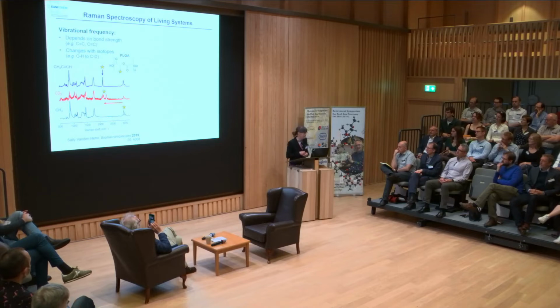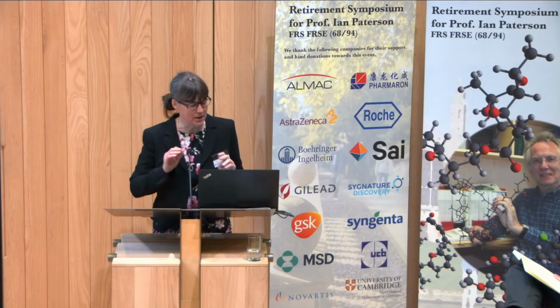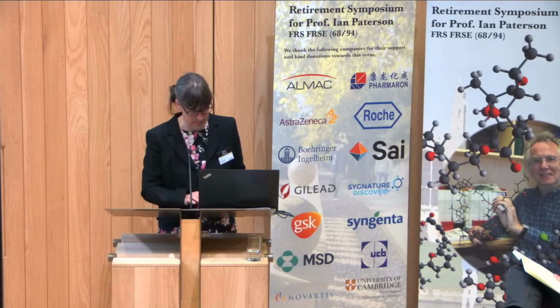So that red shift that's shown with the red arrow, you now get vibrations where the yellow star goes in the red spectrum. If you put an alkyne into that PLGA, you get this beautiful sharp signal. Which is really nice, and I'll talk about where that sharp signal occurs in a minute.